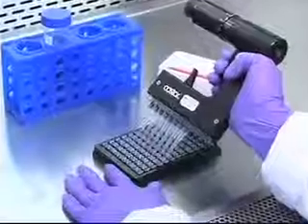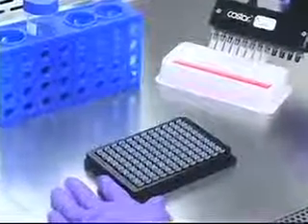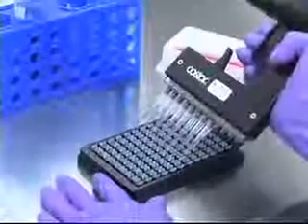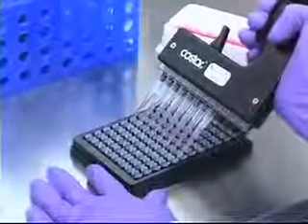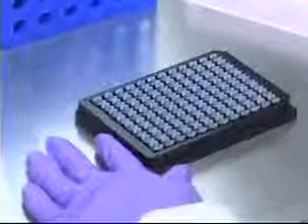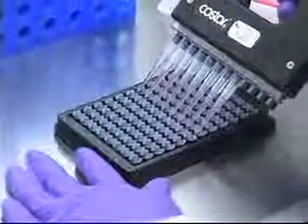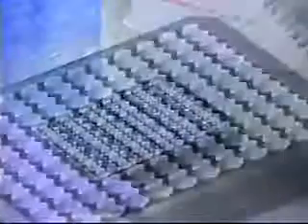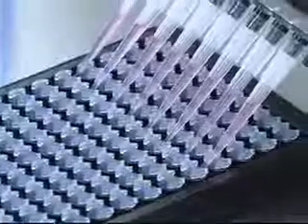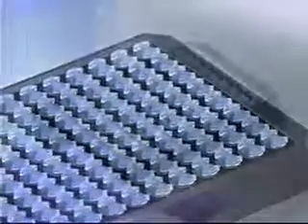The Auris cell migration assay has been designed to work with adherent cell lines, such as HT1080 fibrosarcomas, 3T3 Swiss albino fibroblasts, and HCEC epithelials. Allow cells to reach 80% confluency, harvest, and then aliquot 100 microliters of cells into each well. The optimal number of cells will be dependent upon your specific cell line.